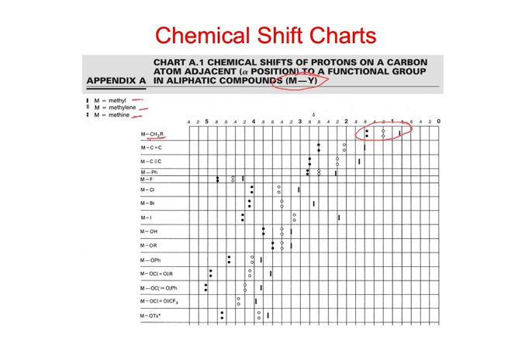But if instead, say, we have a chlorine, so this would be just chloromethane if it was the methyl, or chloroethane if it was a CH2 or something like that, then it's moved down to here. Fluorine is here. Some other ones. If it has an alcohol, methanol, here's the 3. So we just read them straight off like that.